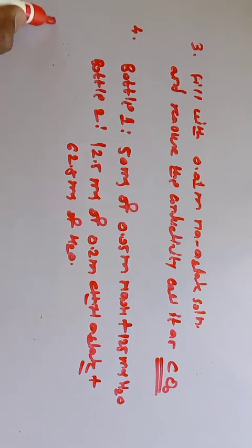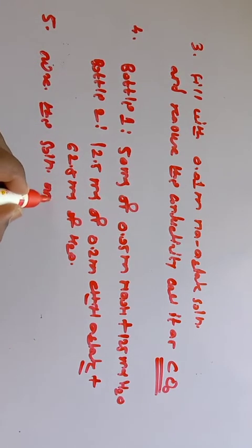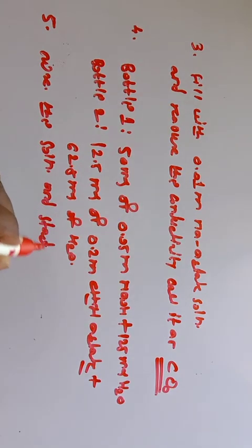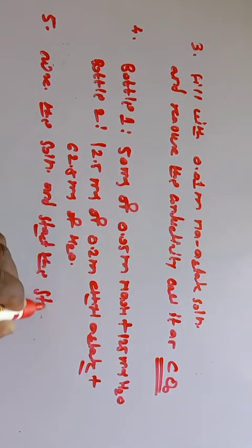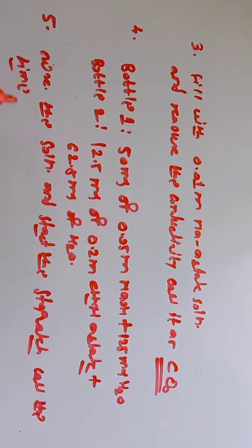Then finally, mix the solutions and start the stopwatch. Call the time of mixing t equal to 0.